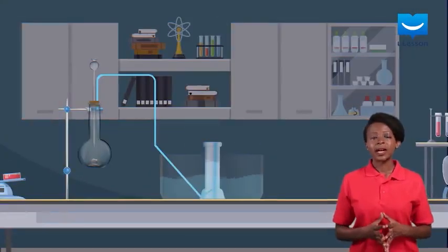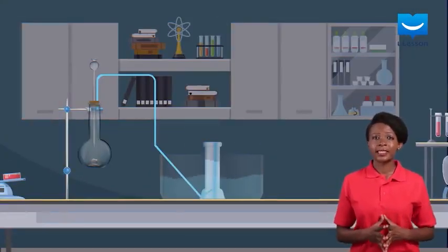In this lesson, we will learn how this knowledge can be put to use in the laboratory preparation of hydrogen gas. Although there are different methods of preparing hydrogen gas in the laboratory, we will discuss only one of them for now. This method involves the reaction between a metal and a dilute acid that was mentioned earlier. The diagram here shows a laboratory setup that can be used for the preparation of hydrogen gas.